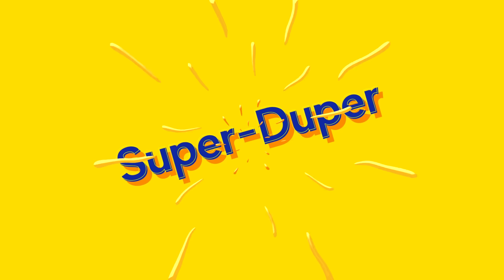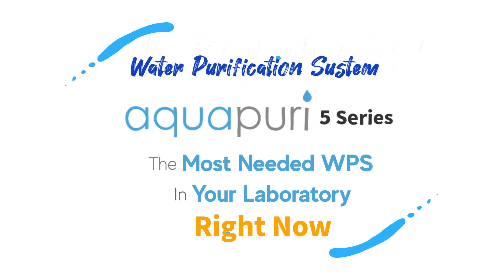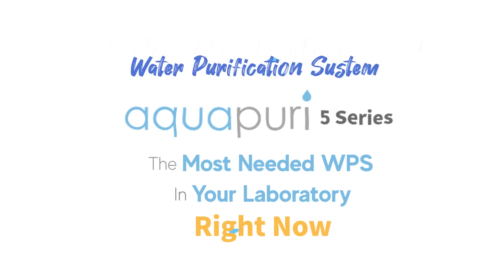What a super-duper Aqua Puri 5 Series — the most needed WPS in your laboratory right now.